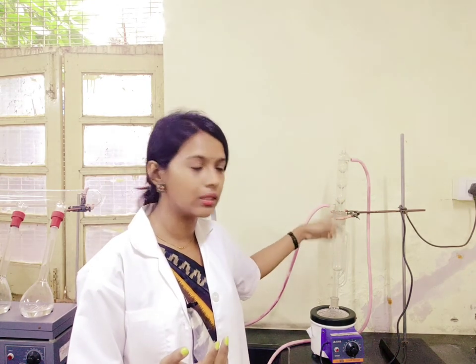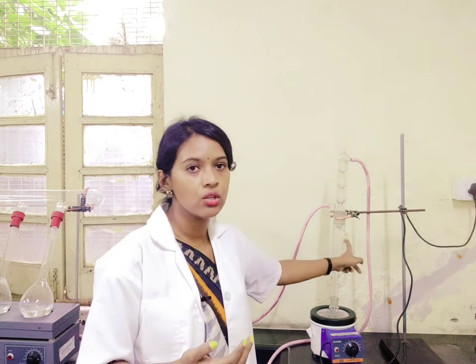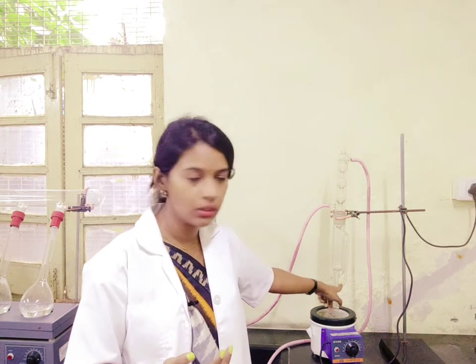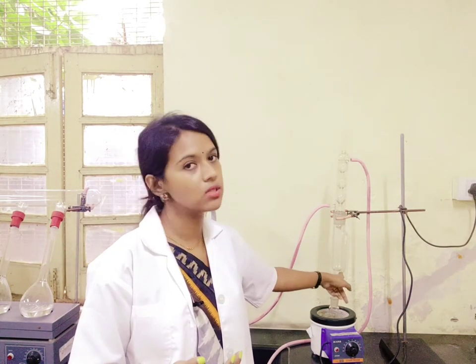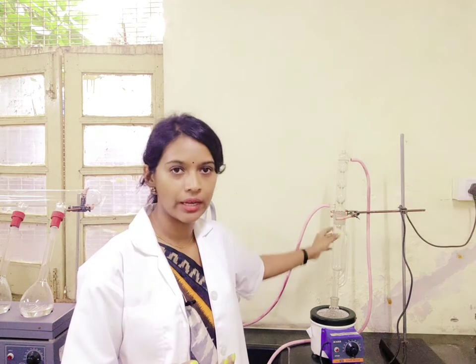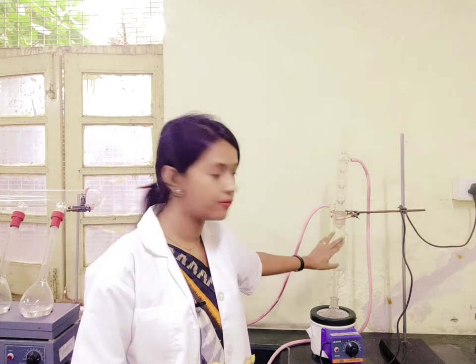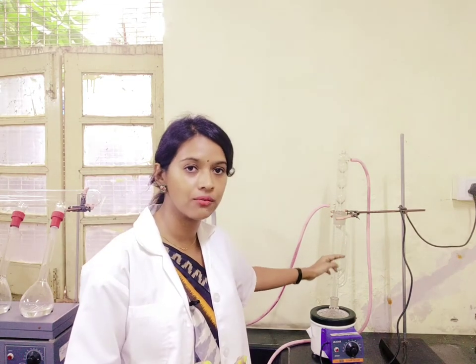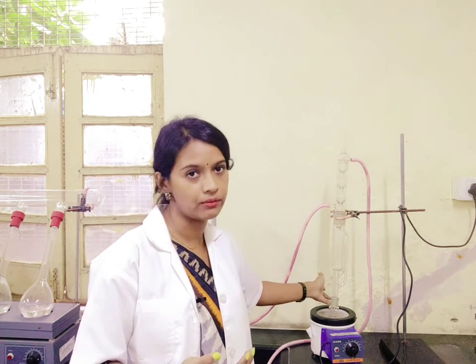So it is a continuous method that keeps on happening. If you look at the Soxhlet chamber, you can see there are two arms. The bigger one is called the distillation arm, through which the vapour from the lower flask comes up. The side one is called the siphon side arm. The main function of this siphon side arm is to take the solvent and drop it back into the solvent flask. When the Soxhlet chamber is filled with solvent up to the level of the siphon arm, it automatically transfers the solvent back to the solvent flask — that is how the fat is continuously extracted.